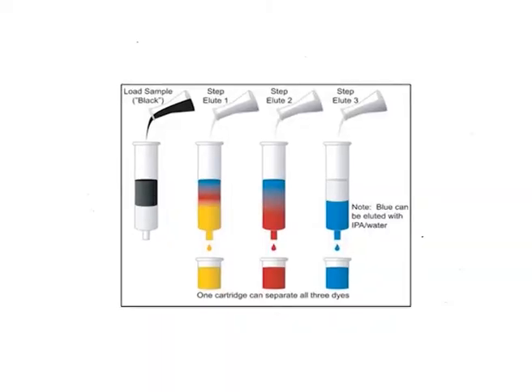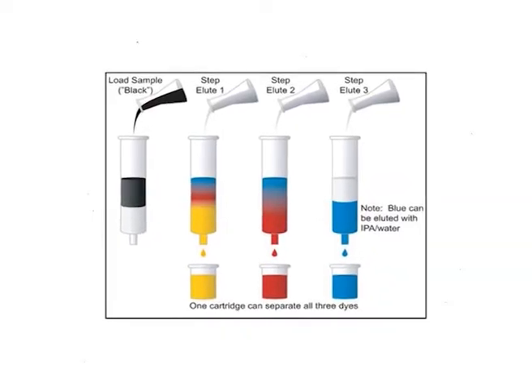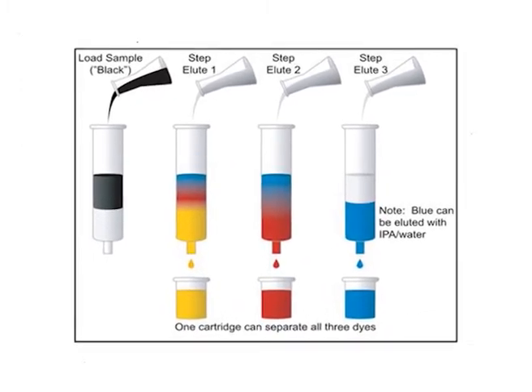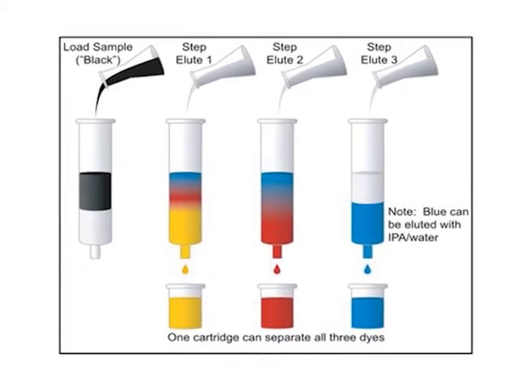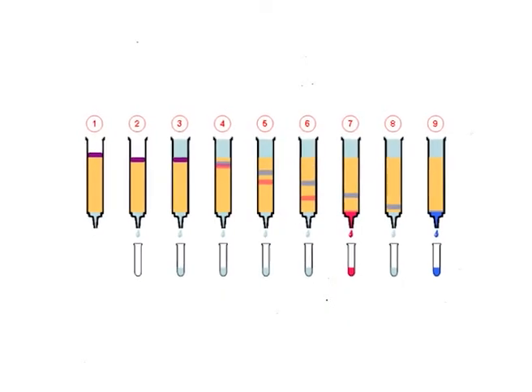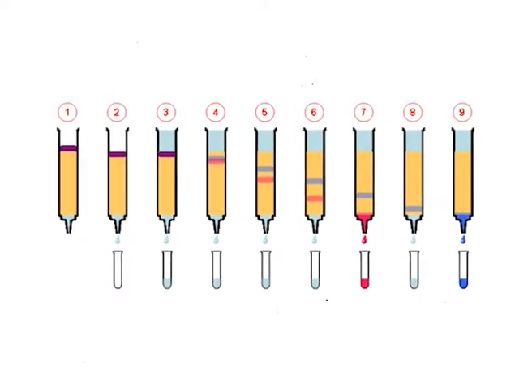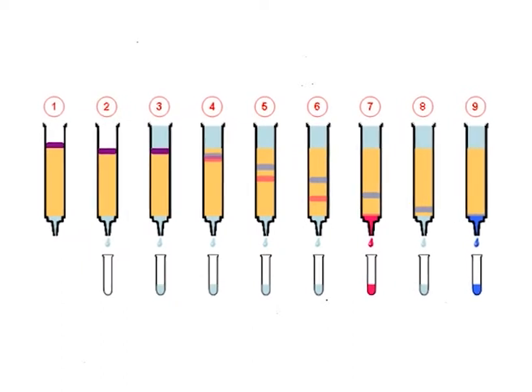The adsorbent is mixed with a suitable liquid so as to form a slurry and placed inside a cylindrical tube which is plugged at the bottom with a piece of glass wool or a porous disc. The sample to be separated is dissolved in a suitable solvent and introduced from the top of the column and allowed to pass through it. As the sample moves through the column, separation of the components takes place depending upon the ability of adsorption. The different fractions are collected separately. Distillation or evaporation of the solvents from the different fractions gives the pure components.